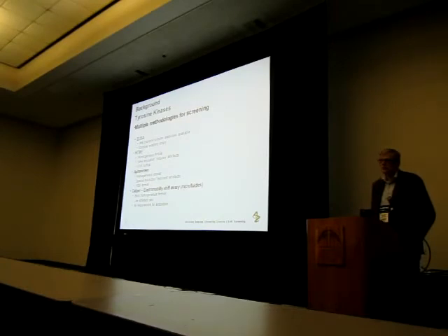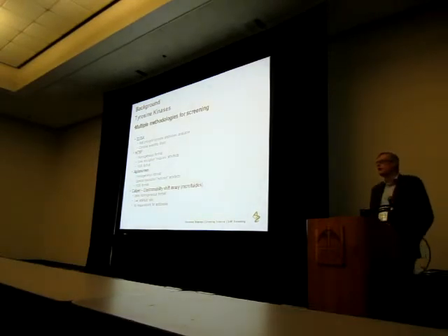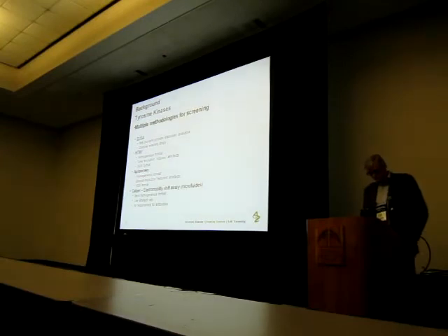I mean, the europium isn't cheap, all right? You don't get much of it out of the earth. That's why it's a rare earth metal, right? So the reagents can be quite pricey for those types of assays. Again, alpha screen. We've worked with many alpha screens, and if you want to come up and talk to me afterwards about what I think about alpha screen, I'm more than happy to tell you. We don't run as many as we used to, let's put it that way.